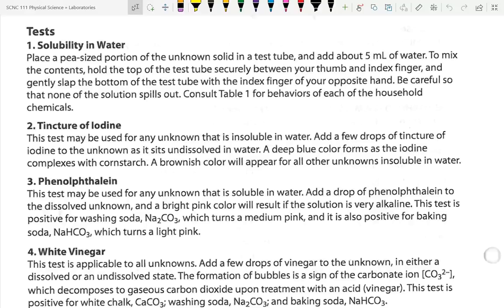And I will just randomly take a sample here. I don't know which one is which either, so I'm just going to look for the one that has the most in it for my test. And so I'm going to take the stopper off, maybe. I have the stoppers numbered, so we'll put the right stoppers back in and not cause contamination. A big concern is contamination in your reagents. That is, if we contaminate this stuff, then everybody after you is going to have messed up results.